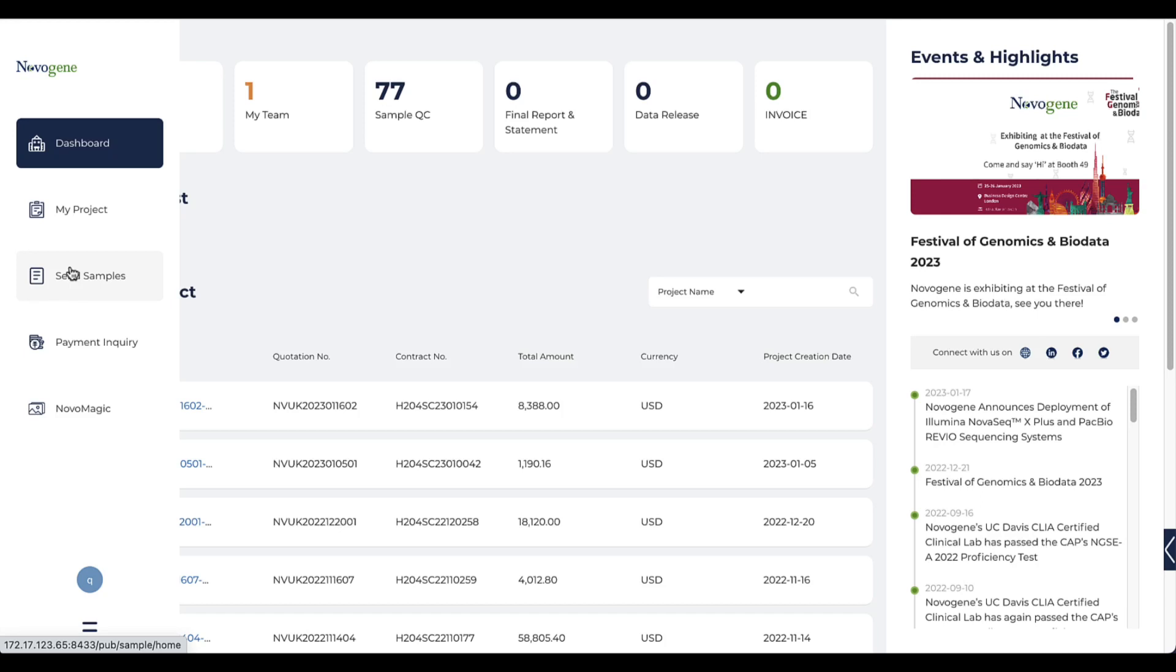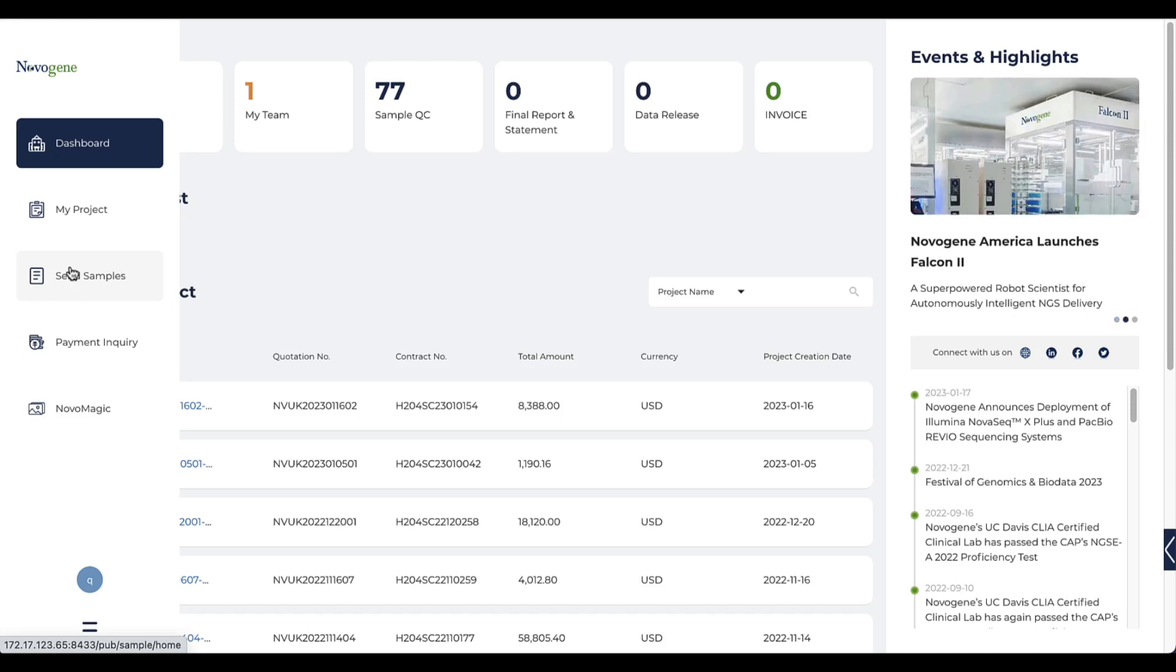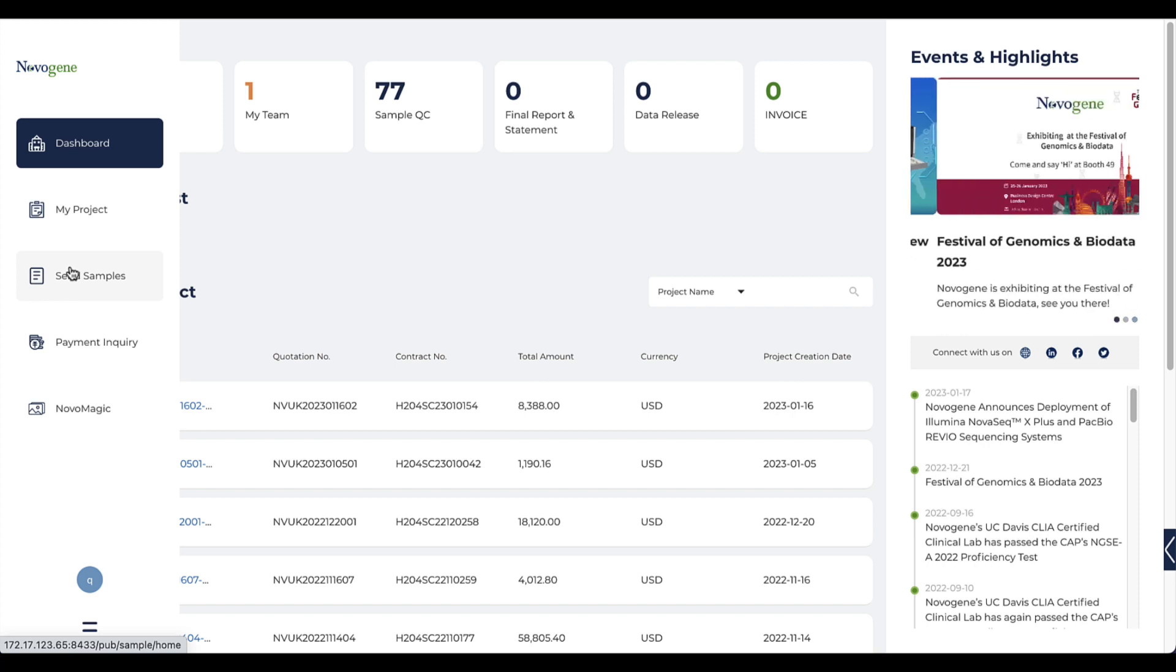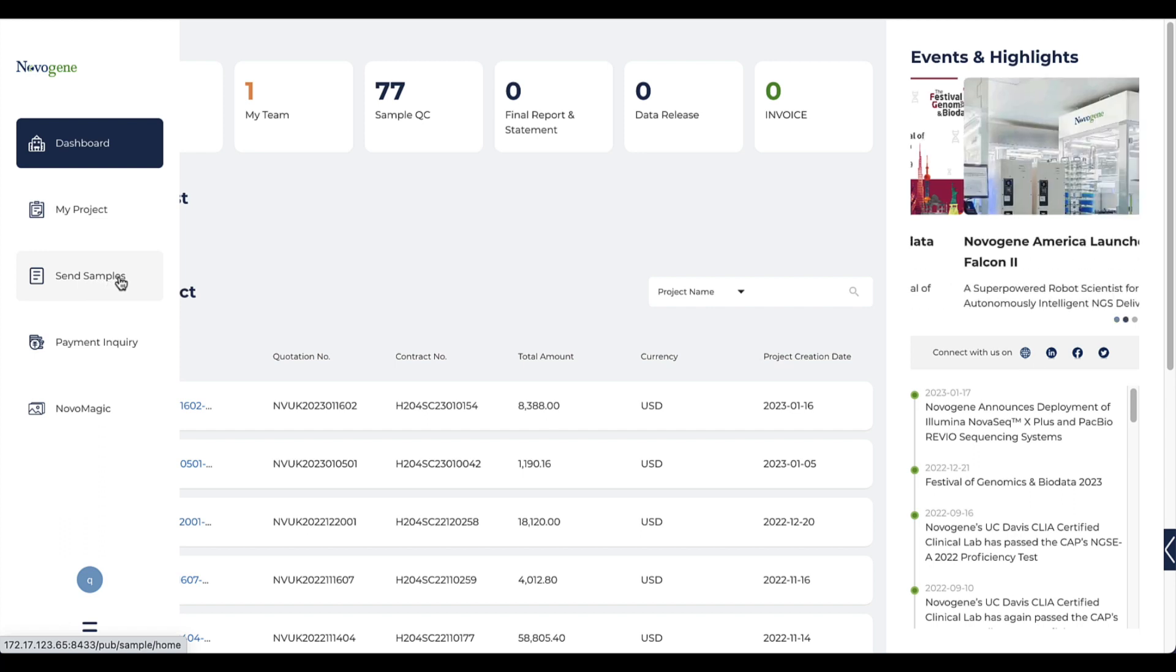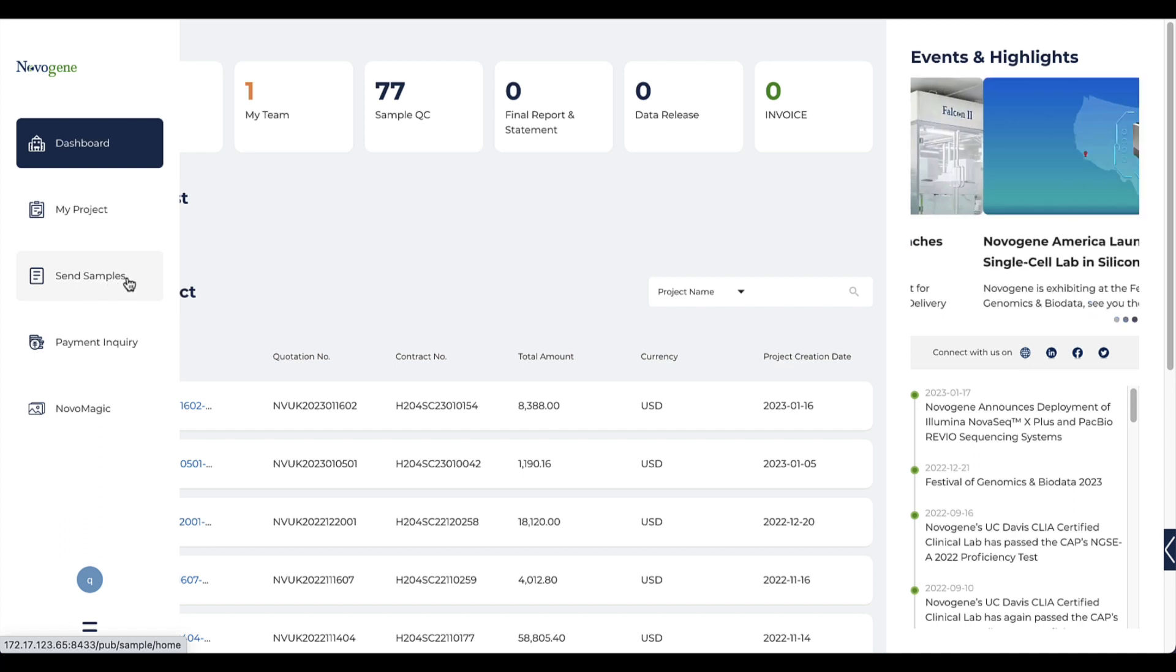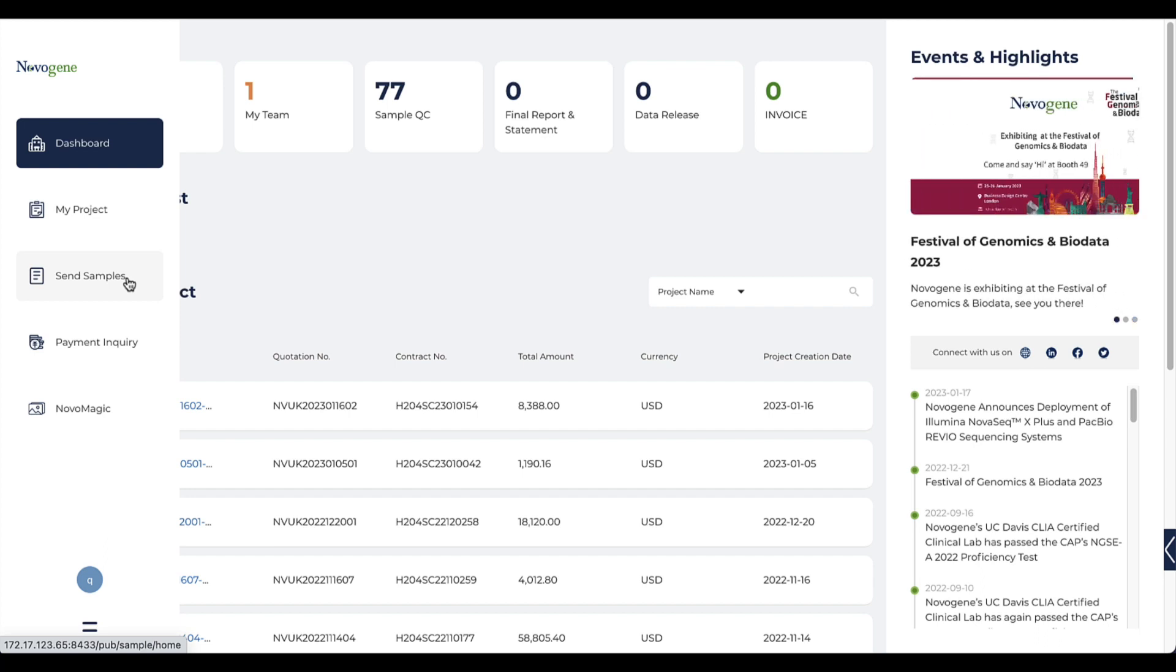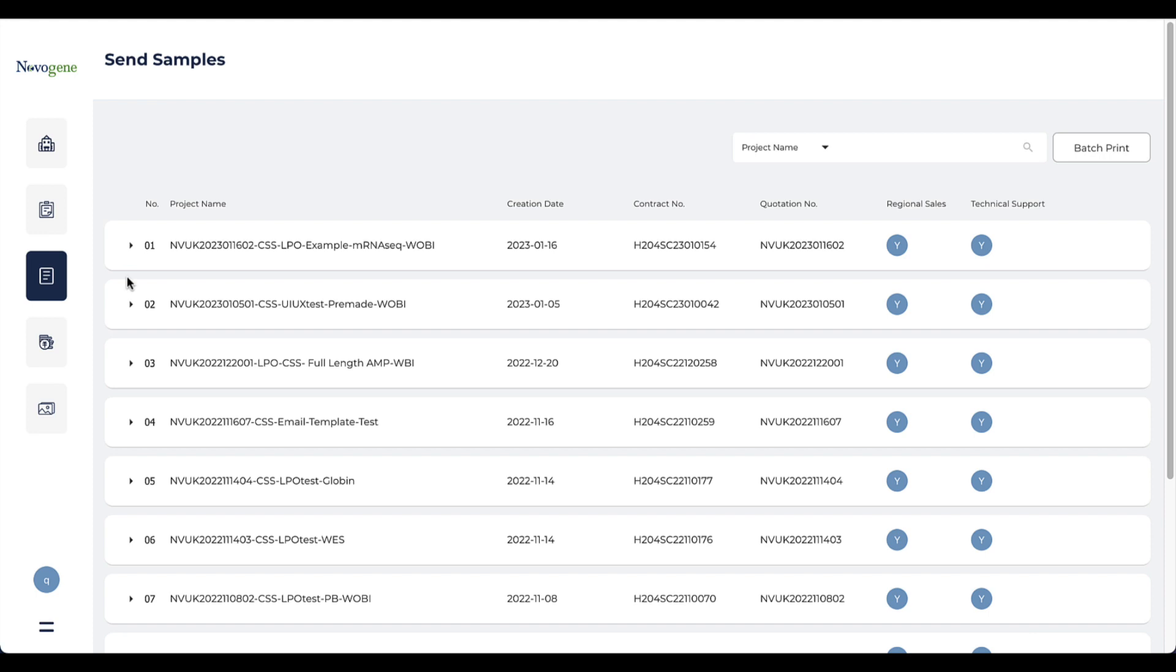Today's video will introduce you to a function about how to upload sample information to the system, which is necessary before you ship your sample to our lab. This video is only for non-premier library projects because the information we need for the products is different. The function for sequencing-only service is introduced in another video.